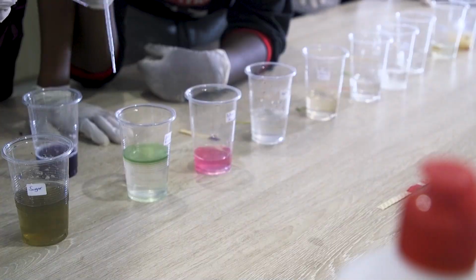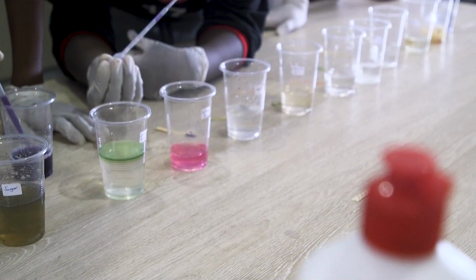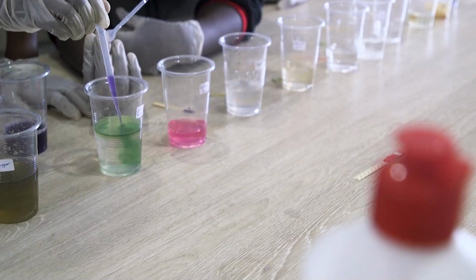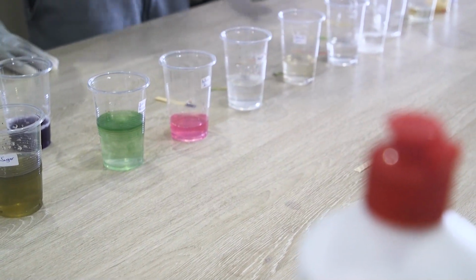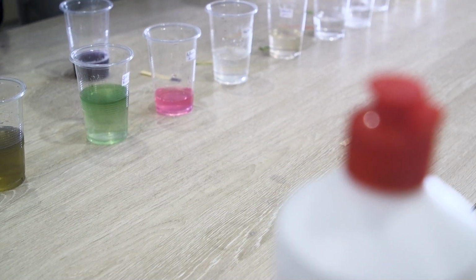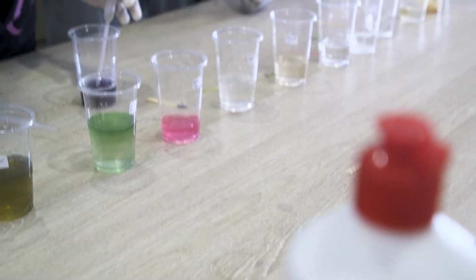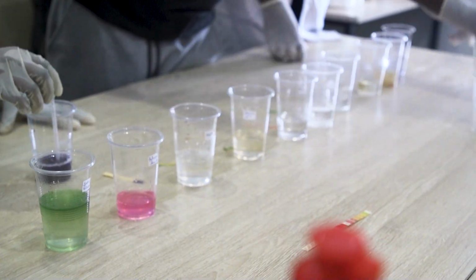And I would next ask you to add a little bit here so that we find. There. Good. See that green now? Do not use that dropper again. Just when you're dropping the liquid, don't immerse it inside the solution. Okay, so we do another one. We throw this one. We just put it inside the bottle.